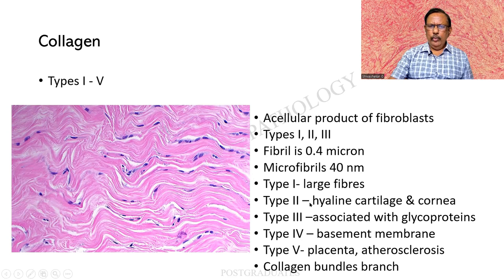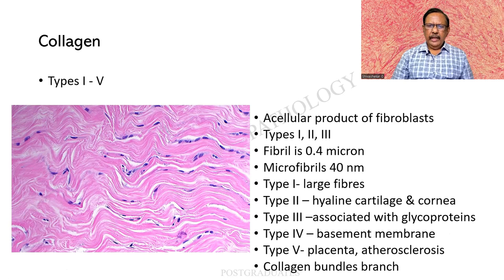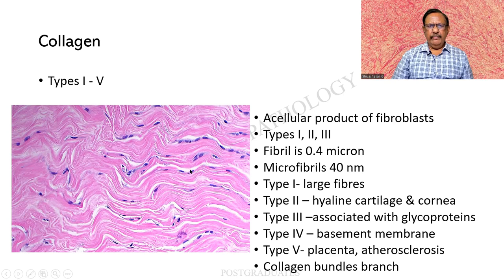There are different fibre types. Type 1 is large. Type 2 occurs in the hyaline cartilage and the cornea. Type 3 is associated with glycoproteins. Type 4 incidentally forms the basement membrane — we never thought the basement membrane is also a form of collagen, particularly in the kidney where it is of great importance. Type 5 occurs in the placenta and lesions such as atherosclerosis. As mentioned, collagen bundles branch but fibrils do not. I am seeing delicate fibroblasts and bundles of wavy, pale collagen, and in some areas a ground substance with gaps that can be artifactual contractions.